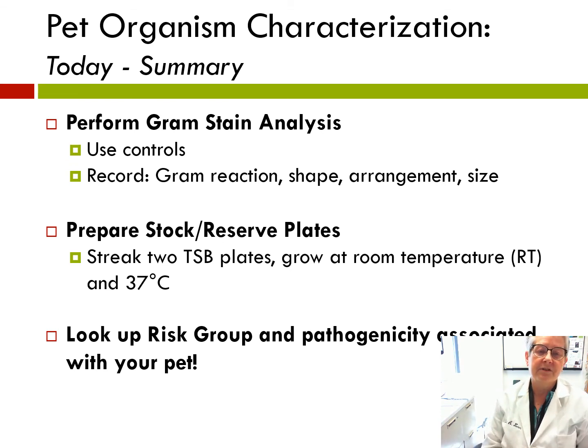So you should be able to start by doing that gram stain analysis and also look up the risk group and pathogenicity that's associated with your pet.